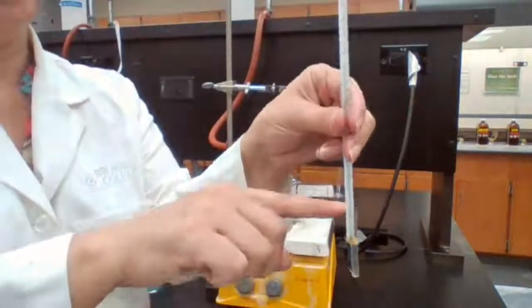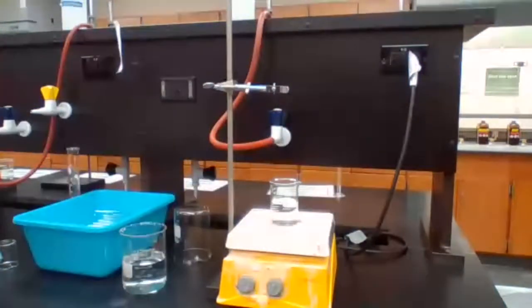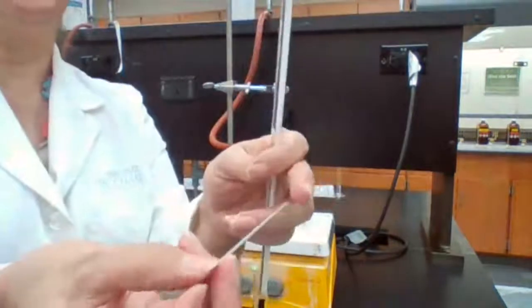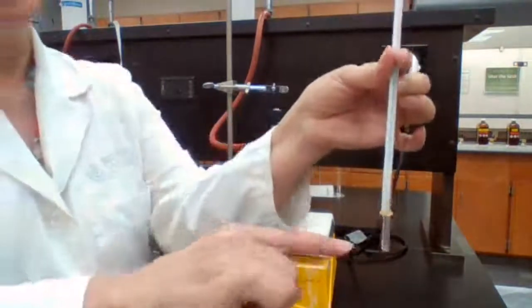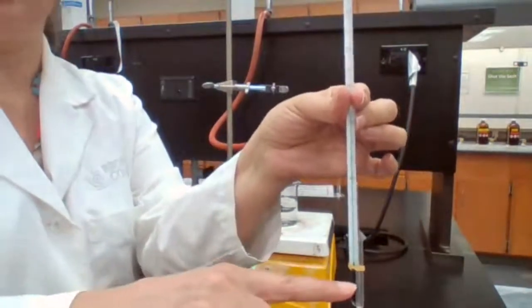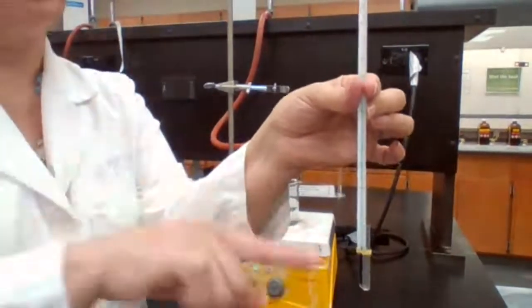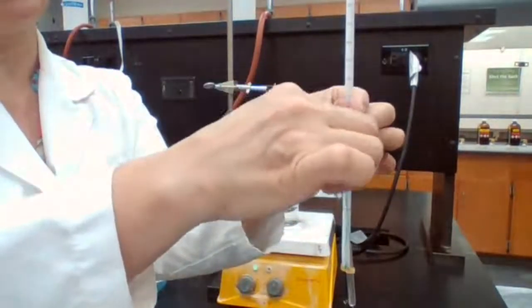We place the unknown liquid into the seal tube and use a capillary tube with the open end down. Here's the capillary tube with the open end and the closed end. The liquid goes inside the seal tube. So I'm going to add a few drops of unknown A. I'm using unknown A for boiling point also. I'll be right back. I'm just going to the fume hood to get a few drops. I place it in the seal tube and place the capillary tube with the open end down.